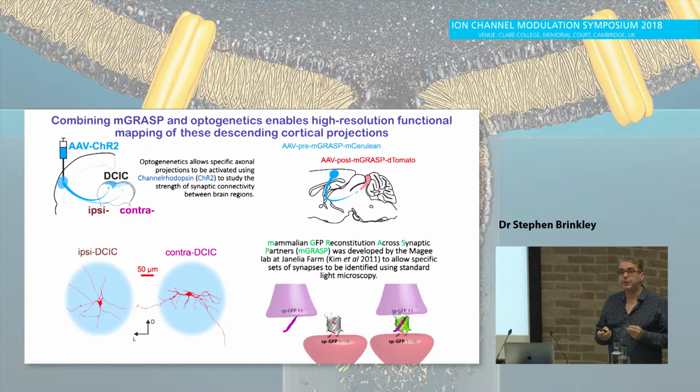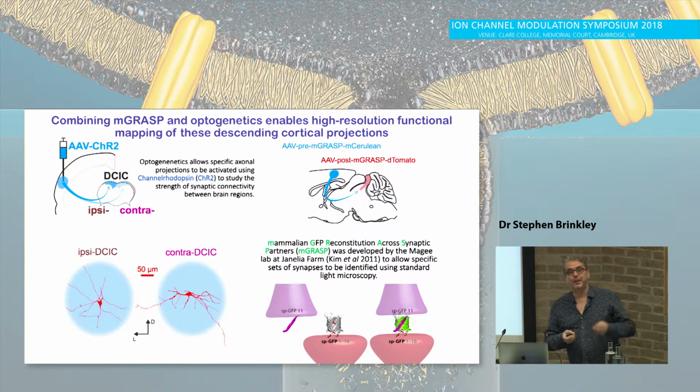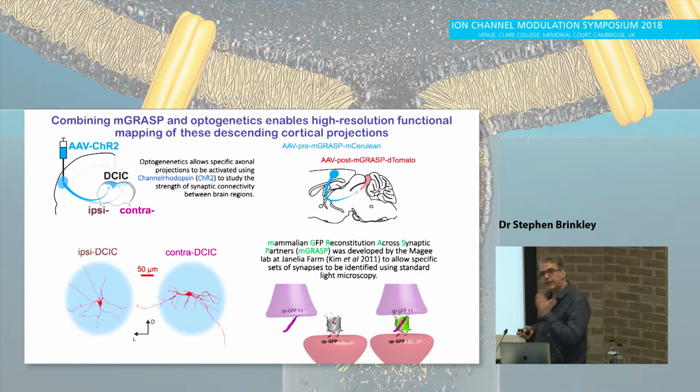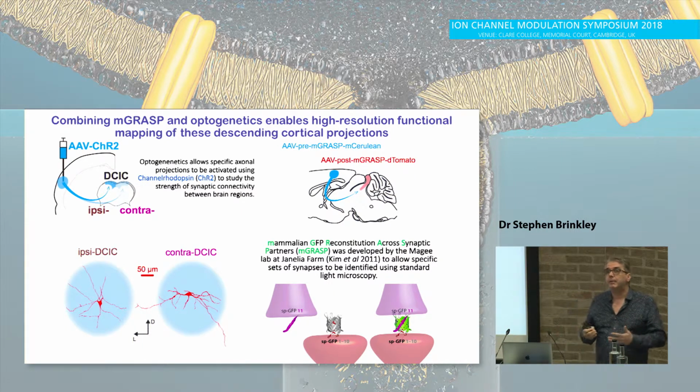But this is our point of principle study, and this is the auditory system. This is the projection from the auditory cortex to the inferior colliculus, and its ipsilateral and contralateral projections. We picked it because we know they're different. We know the ipsilateral has a stronger projection than the contralateral, and we wanted to see if these assays would pick that up and how sensitive they would be to that, and I was surprised. Mainly because MGRASP is amazing. Why does it work?